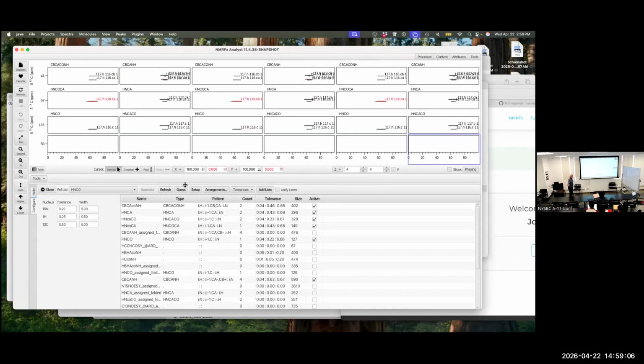So typically we talk about some of the experiments: NCA, NCO, CA, HNCO. We're going to use 6 different experiments to give you the carbonyls and the alpha carbons and the beta carbons of a given residue and the residue before it. There's a lot in here because when you load these projects, they have a bunch of assigned peak lists in there already, so you can use them to do our assignments and then check to see if we get the same assignments.